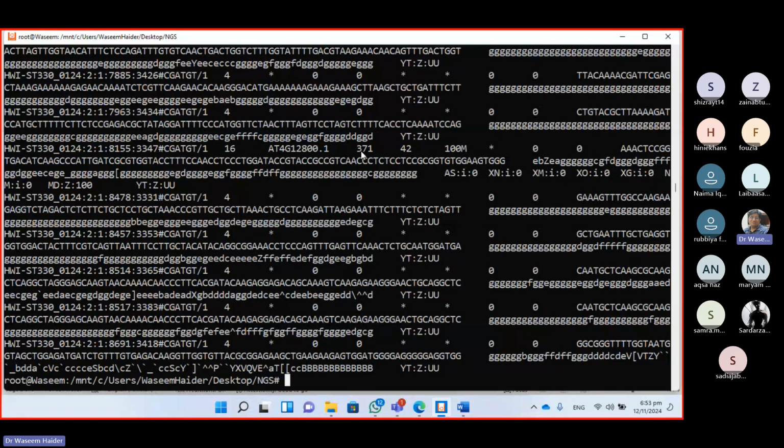So for that reference gene or transcript, from nucleotide number 371 up till nucleotide number 470, it would have been aligned, and there is another thing that is 42, and this is just 100M. So this is just good quality. This is another scale. It's telling us this alignment is pretty good quality.